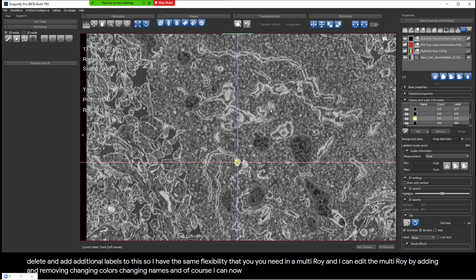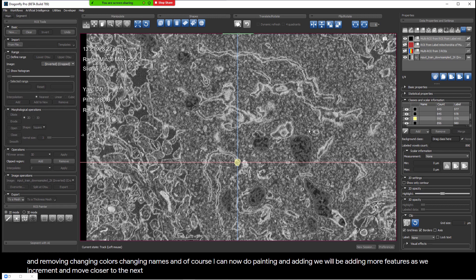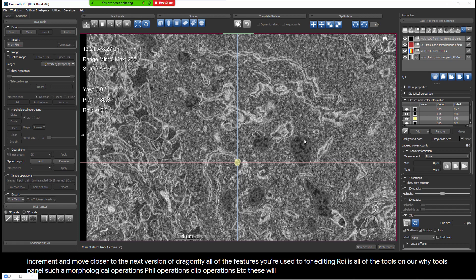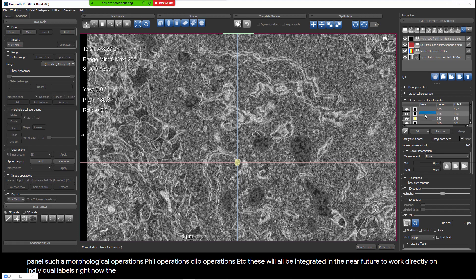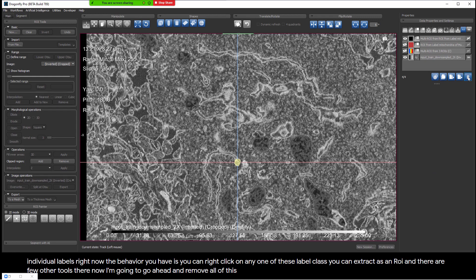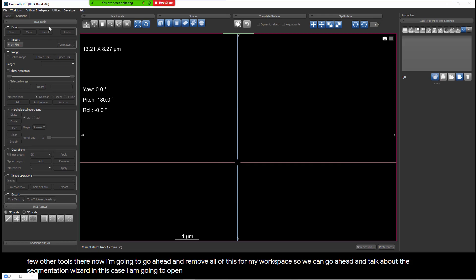We will be adding more features as we increment toward the next version of Dragonfly. All of the features you're used to for editing ROIs — all the tools on the ROI tools panel such as morphological operations, fill operations, clip operations — will all be integrated in the near future to work directly on individual labels. Right now, the behavior available is you can right-click on any label, clear it, remove that label class, extract it as an ROI, and use a few other tools. I'm going to remove all of this from my workspace so we can talk about the Segmentation Wizard.